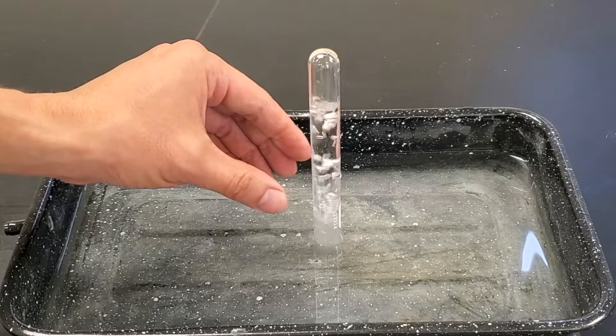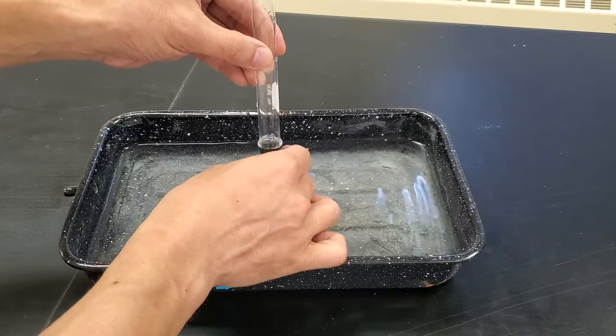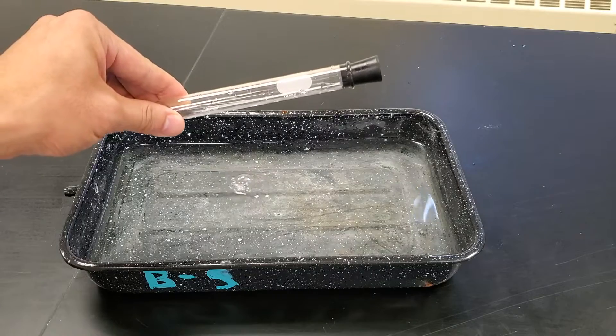As the gas is going up, it's pushing the water out. I'll raise the test tube to draw the remaining water out and stopper it. That's how you get hydrogen gas in a test tube.